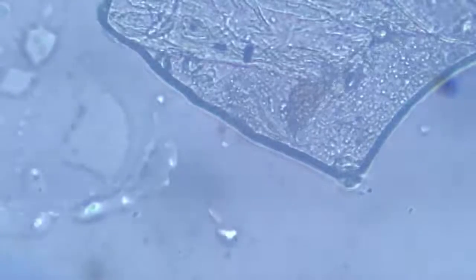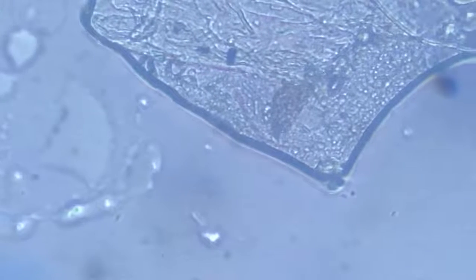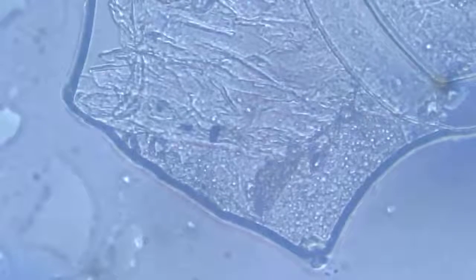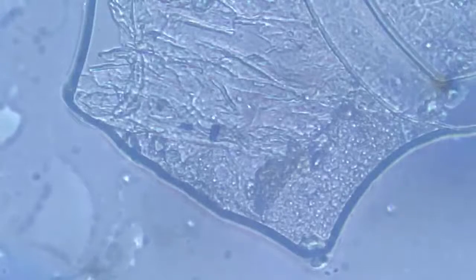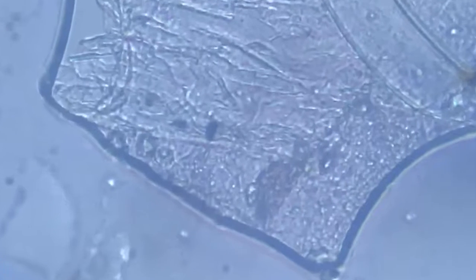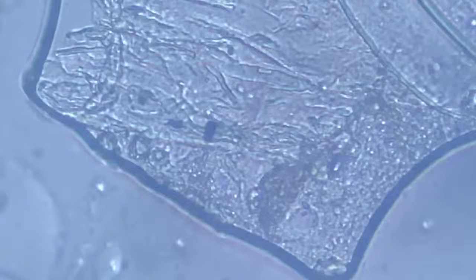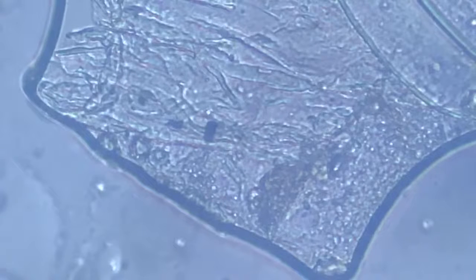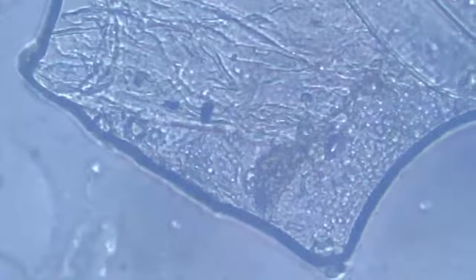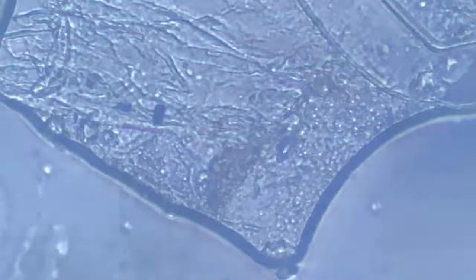There it is, completely trapped between this water. It becomes one with the debris. It has become one with the debris. And so squeezed is its death that it can't even burst open to release its filaments. The contractile vacuole is still shrinking, but then it's just too late for him. It's been a very squeezy death for him. I'm sorry, my friend.